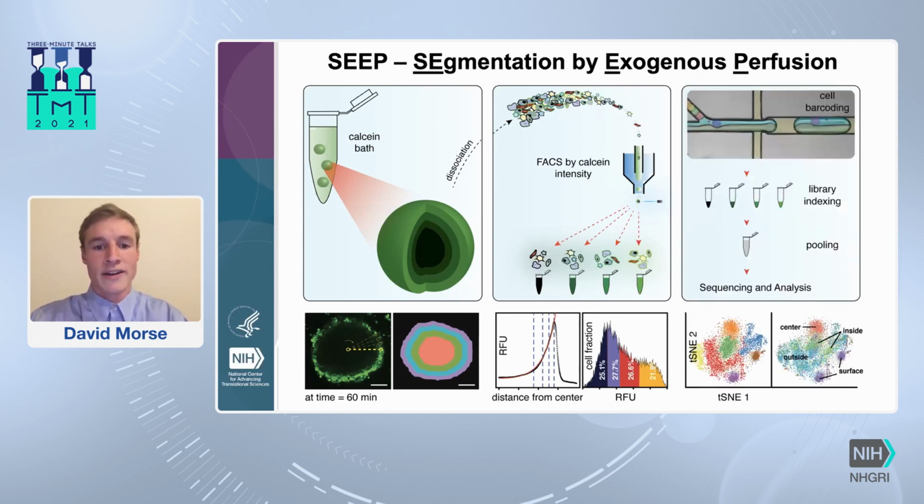After binning according to spatial positions, cells are processed through a droplet-based microfluidic system to allow for transcriptome barcoding, library amplification and indexing, and high-throughput sequencing. The single-cell RNA sequencing data is then analyzed and incorporated with positional data to characterize cells by both their transcriptomic and their regional identity. Tissue regions can then be described by their composition of various transcriptional states.